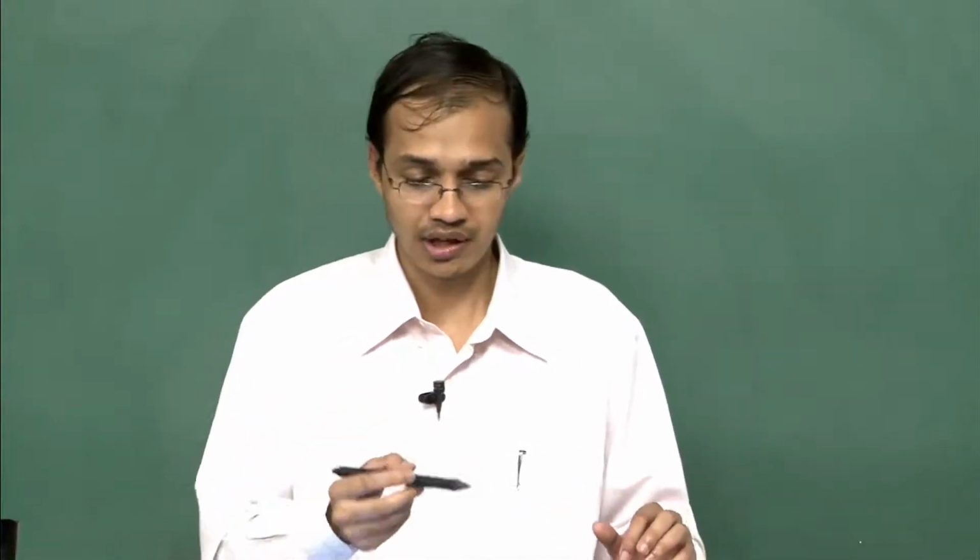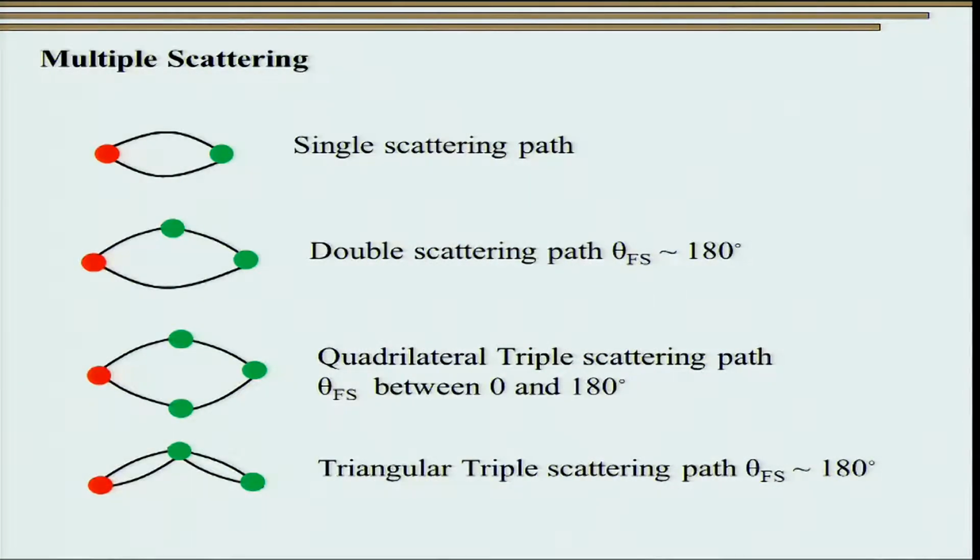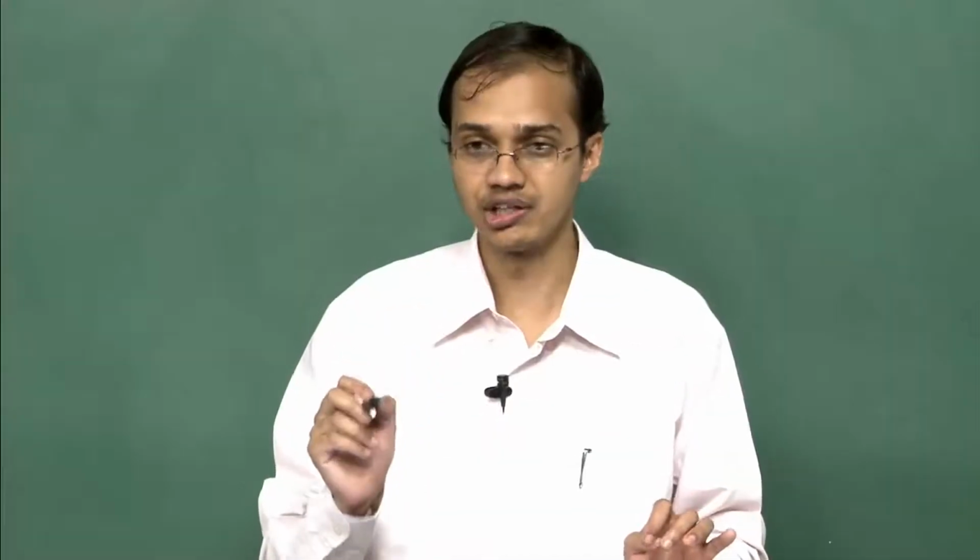Now, we can always find out what kind of interaction is going to occur between two neighboring atoms and what we expect to get as an output. More about it later, but remember that for a given atom, the kind of interaction that takes place depends on its neighborhood. This is the very genesis of the X-ray absorption spectroscopy technique, wherein we can get information about the atomic neighborhood of a particular atom or element under consideration.